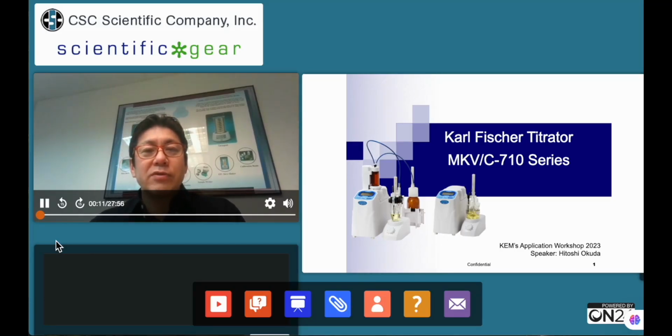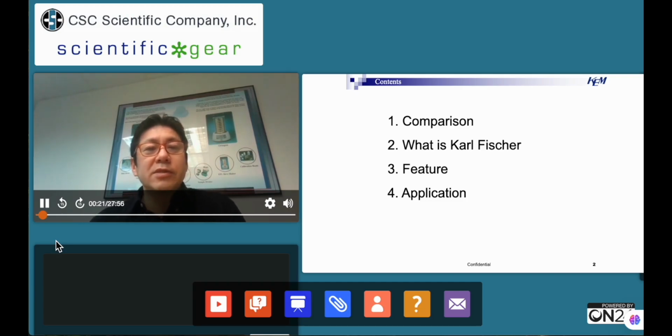Today I'd like to give a presentation about Karl Fischer titration to measure the moisture of a sample, using this presentation slide. Okay, so this is today's content. There are 4 contents, from comparison to application, according to this.